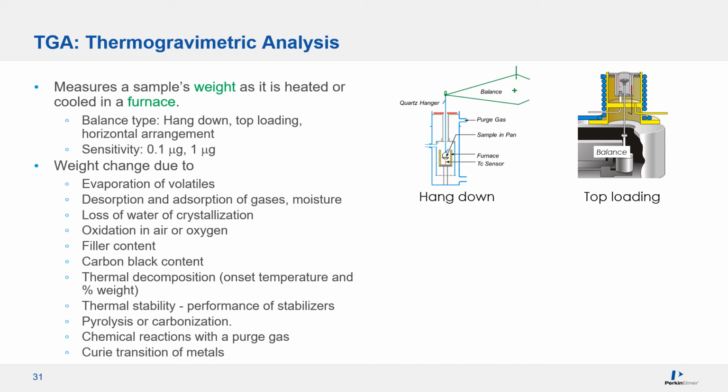Hang down design usually offers the best sensitivity, as good as a tenth of a microgram. So where is TGA used? Anywhere the weight changes due to the reasons listed here.